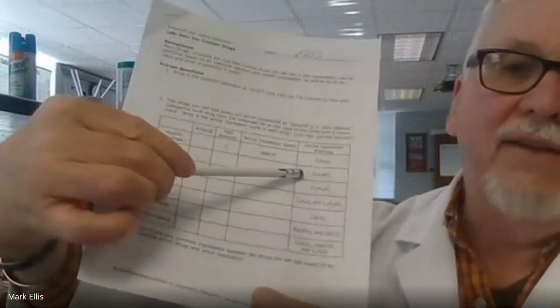So what you need to do is check whether it's an antacid or a pain reliever. What is the active ingredient? You can look that up on the internet, or if you got a bottle of it at home. And then I gave the formulas for you for all those, because those can vary and can be hard to find. And then look for any similarities, write that in there for number 3. And then you'll see the things that you need. Exact quantities are not necessary, but I'm not going to read through step by step. You need to do that tonight before the lab.